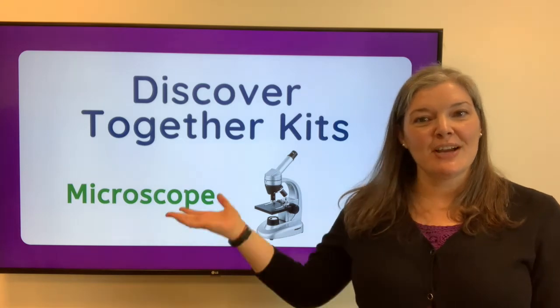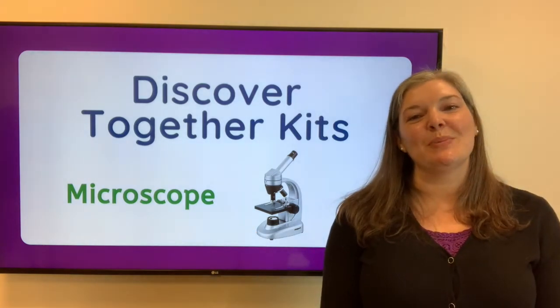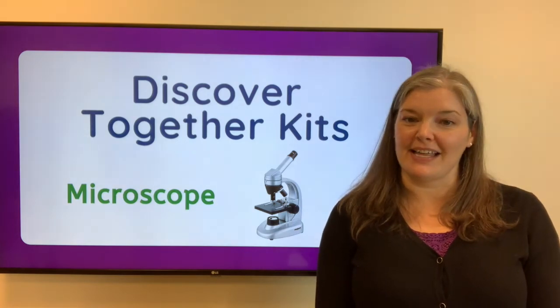Let's discover microscopes. In this video, we'll be learning how to use the microscope to look at a slide.